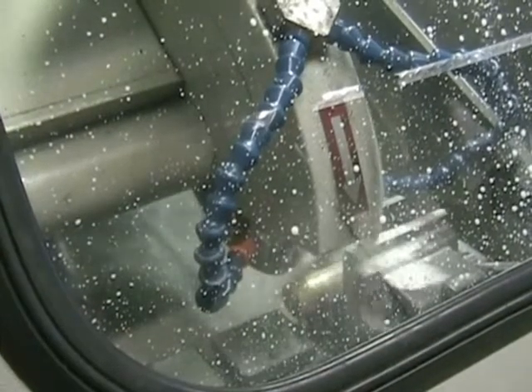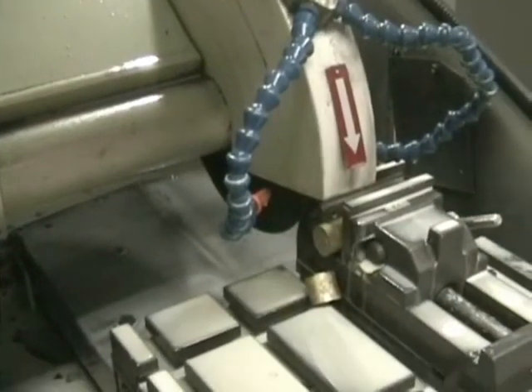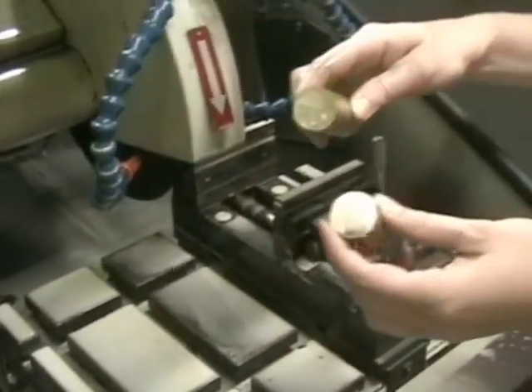For this saw you have to turn on the water because the saw blade will heat up when you're cutting, and that could possibly cause microstructural changes. Here I'm moving the table into the saw blade. You can also operate this saw by pulling the blade down onto the sample. Here you have the finished cut, and there's your sample.